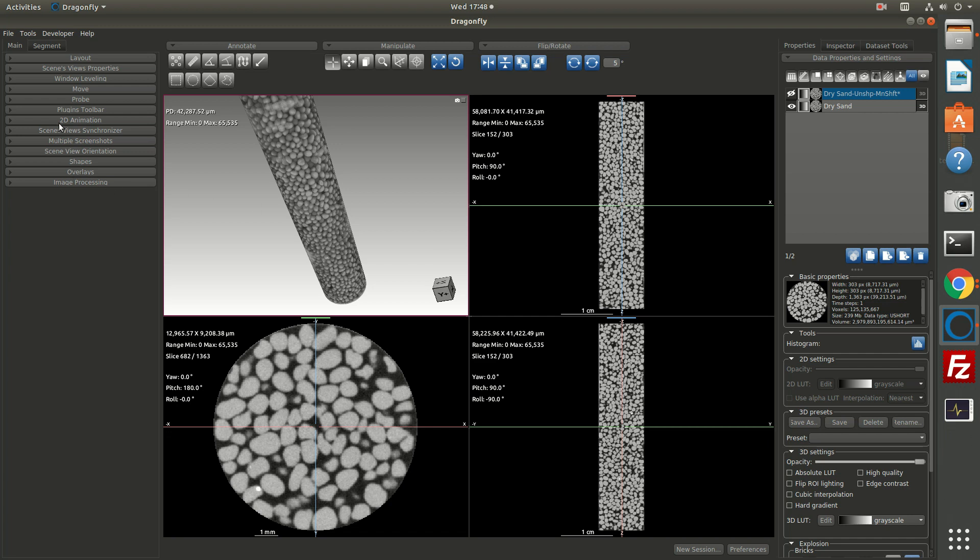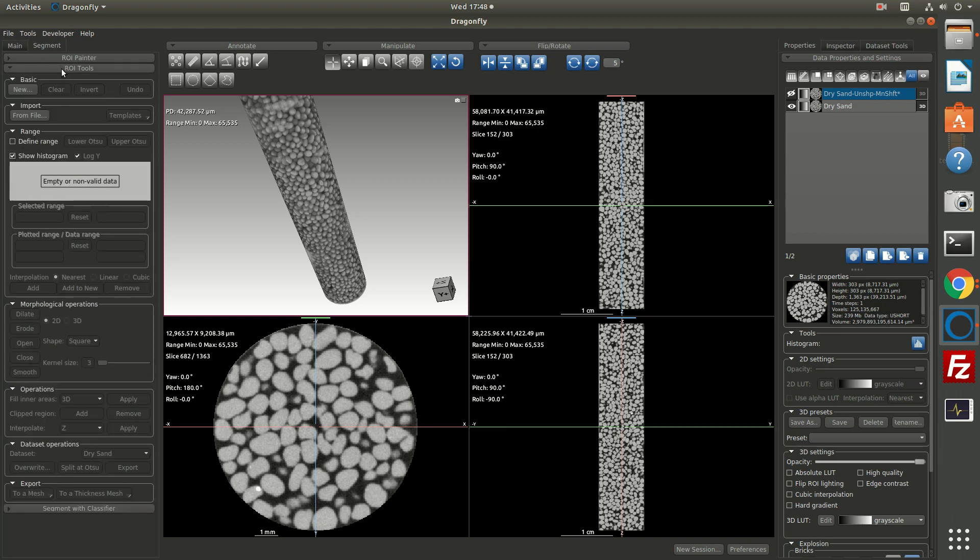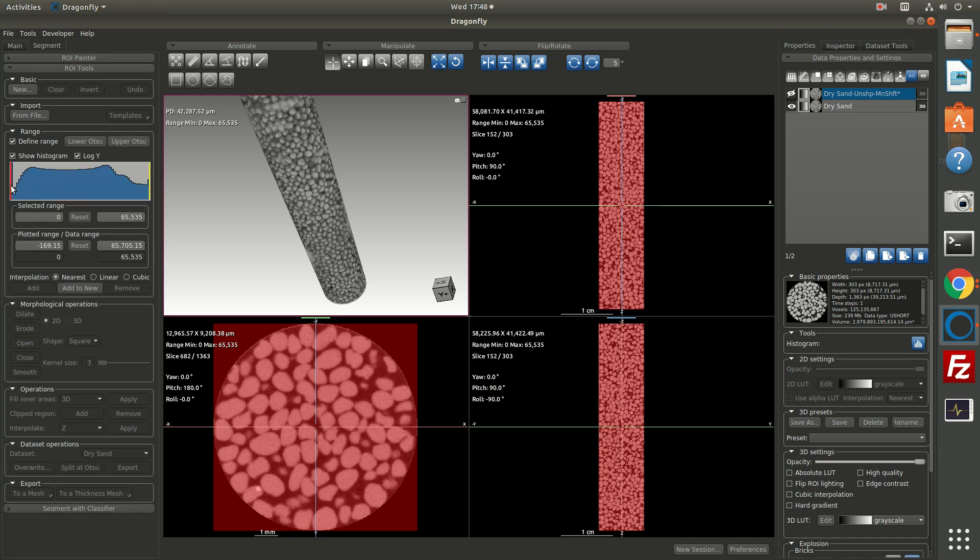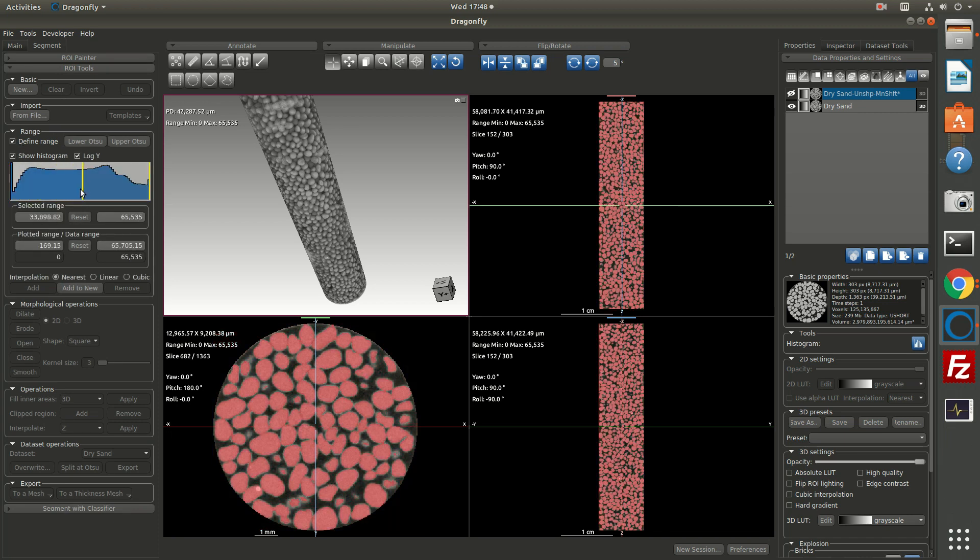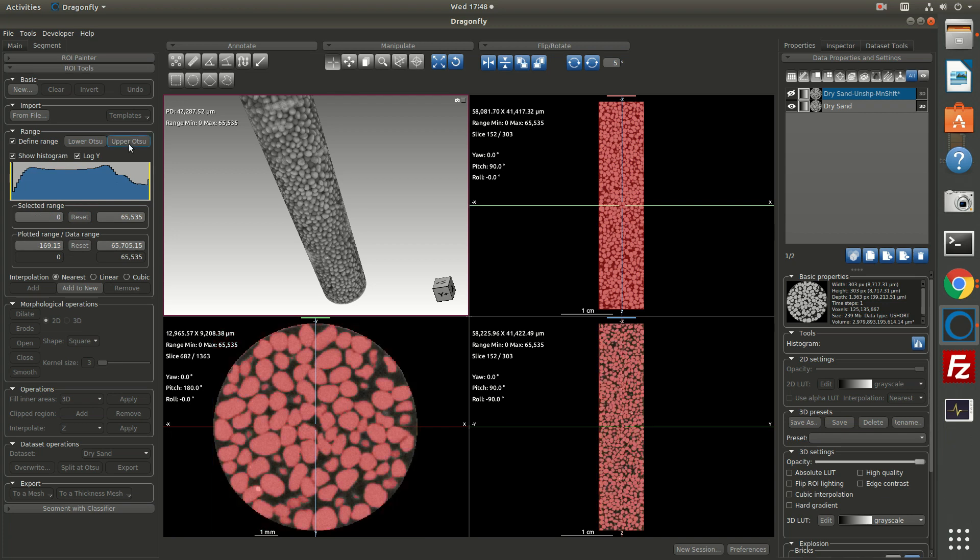So what we'll do first is turn to the segment tab where we find the ROI tools. Here you'll find tools for thresholding, for example, so we could threshold to try and find the right intensity that identifies the grains. If I click reset, you'll also notice there's a button for upper OTSU. This will allow you to automatically segment based on the threshold of the entire image channel.